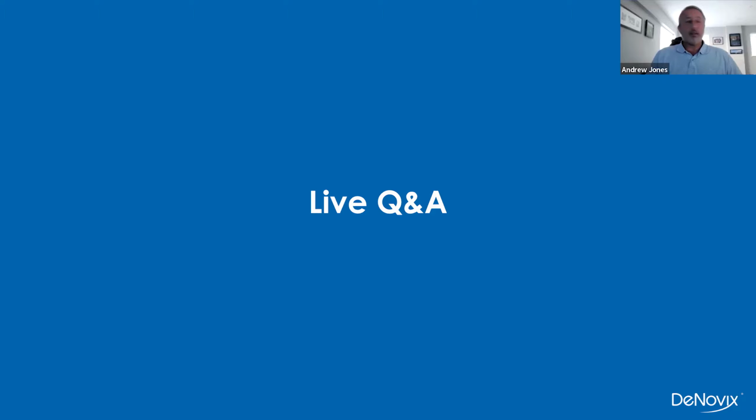I think that is all the questions, unless I am missing any. So if there are any questions that we've missed, we will go through the list after the webinar. And if you've missed anything or if we promised to follow up, we'll certainly get in touch with you to make sure that you have any answers. If we've missed any coming through in a flurry at the end. But I think that's it for questions for you, Grace. So thank you very much. Of course. Excellent presentation. We appreciate it.